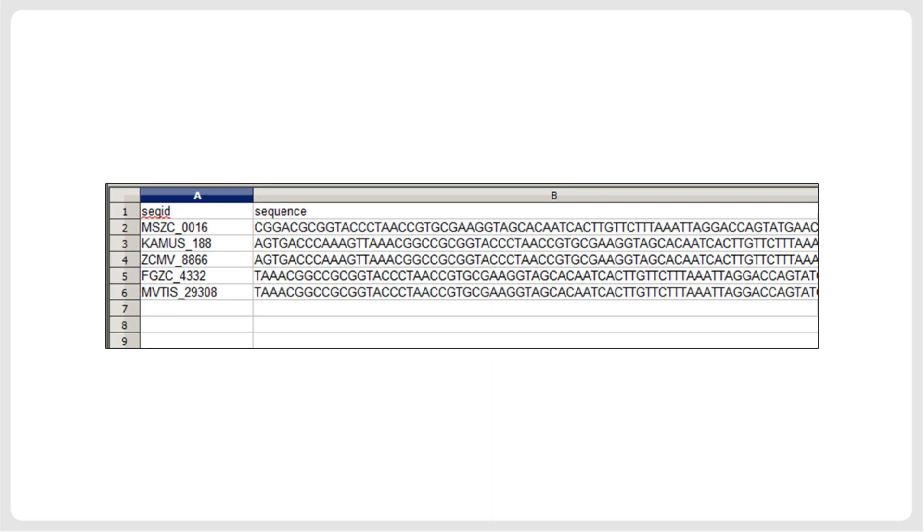From this point on, any spreadsheet editor will offer many options for formatting or sorting the data, or combining it with other data, such as the sequences downloaded from GenBank.